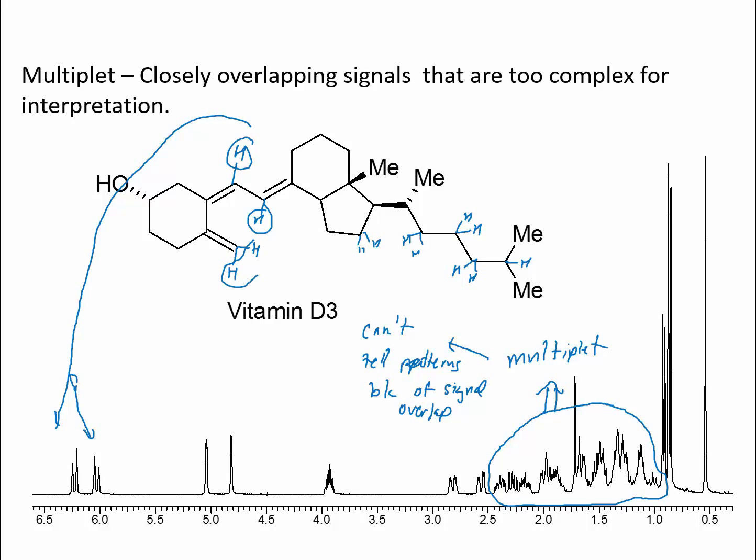It's not a doublet, it's two singlets. This hydrogen right here is expected to be much higher than any of the others, and we can see this one here. The signal's not blown up enough, but it should have at least 5 lines, should be a quintet.